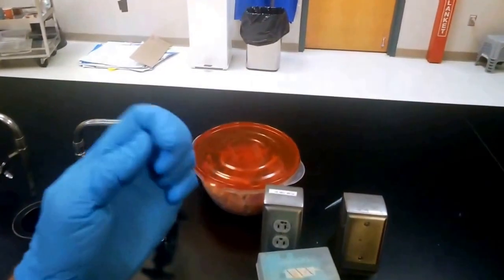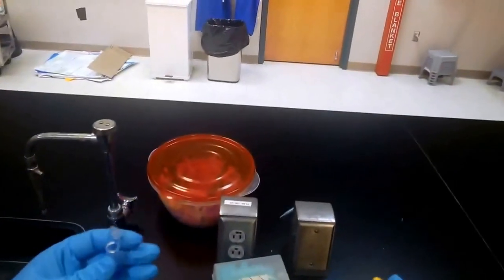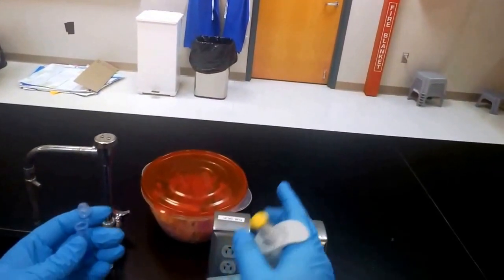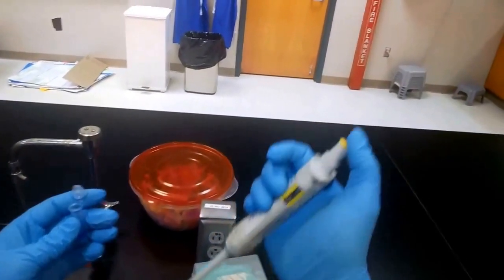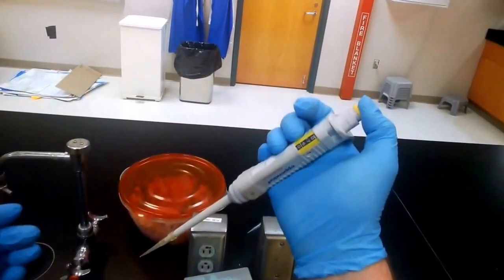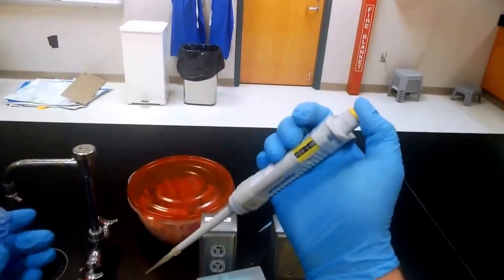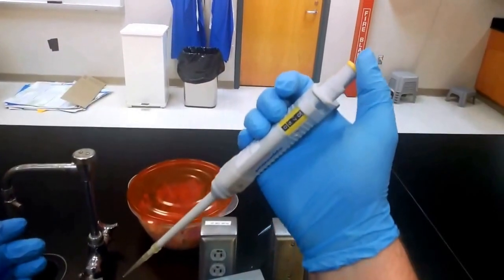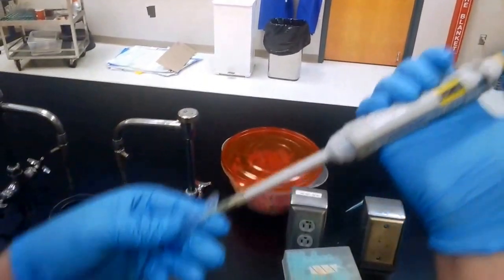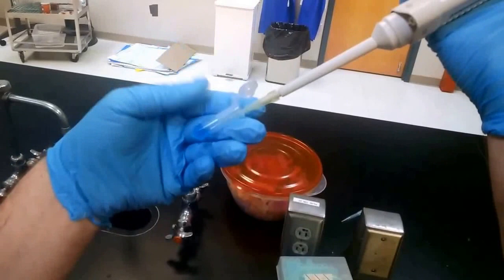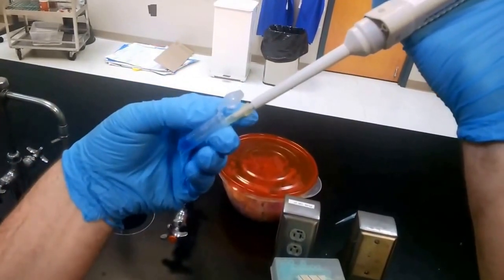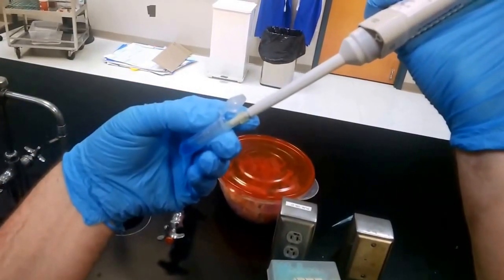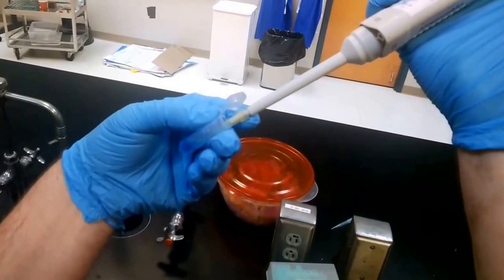We'll set our pipette correctly in our hands. Now the two buttons here—there's the first stop, there's the second stop. So we'll go to the first stop, depress the tip into the solution, and slowly pull up so that we have a nice cone. Notice there's no air bubbles.